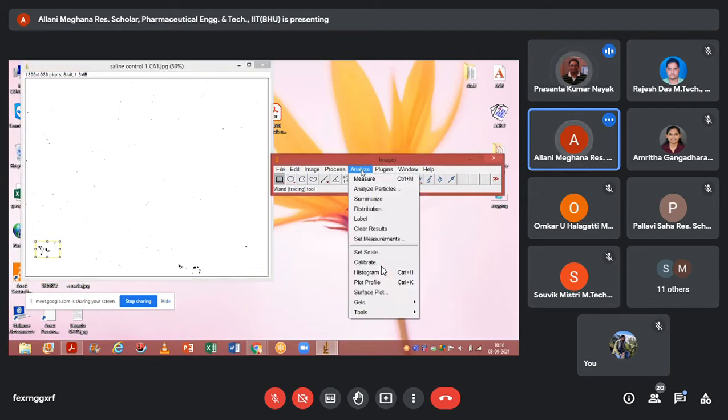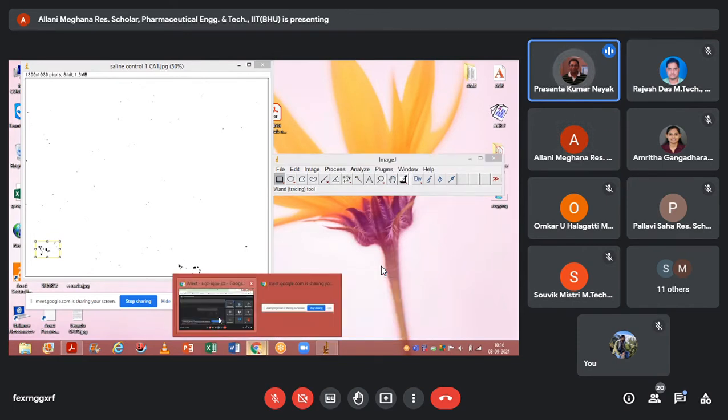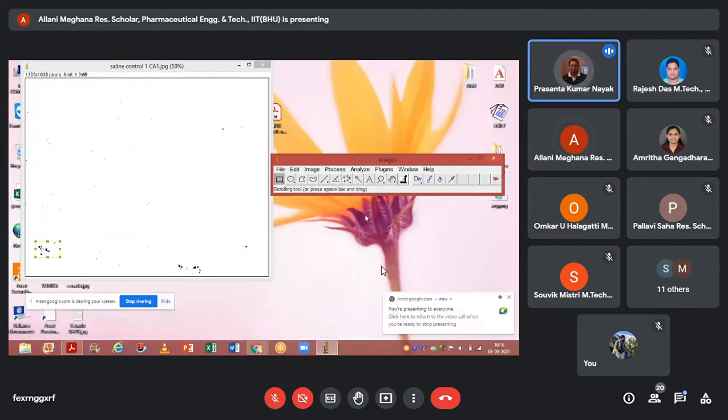Stop here, Alani. Yes sir. A little bit of modification. Okay, please. Sir, here, how is that rectangle selection coming? No, no, you keep that. Okay sir. I'm telling you what you actually missed.